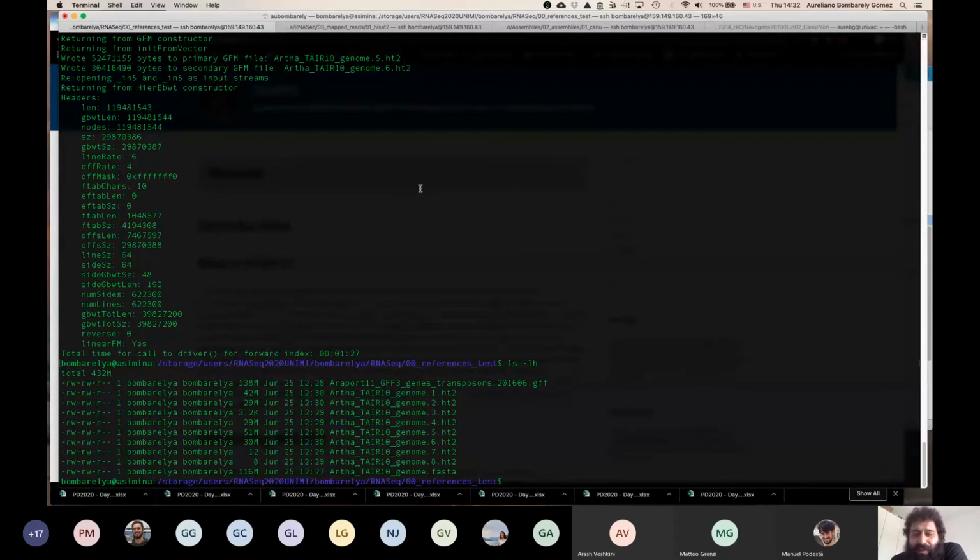So of course the server was completely overloaded and overheated, because when the CPUs are working too much, sometimes computers, especially old ones, can overheat, and then the computers just crash. So she almost fried the computer because she was very impatient. Keep in mind that you need to wait sometimes until the program is done.